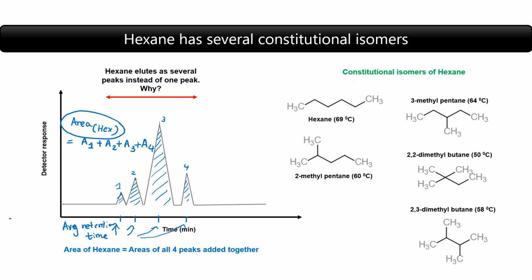And for the data part, you will be provided with the 2 gas chromatograms for fraction 1 and fraction 2 analysis, and you are supposed to calculate the areas under the peaks and determine the composition of hexane and toluene in each fraction.